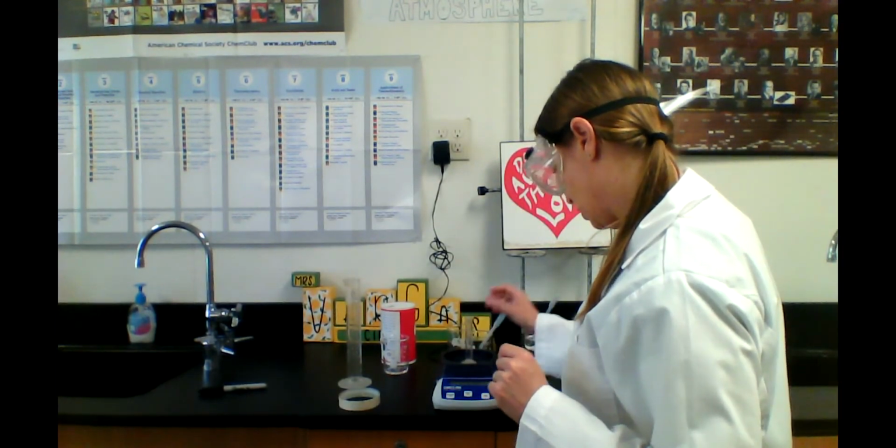Okay, last but not least, check this out. And the highest concentration should have the highest density, right? That's zero. Rinse this out.